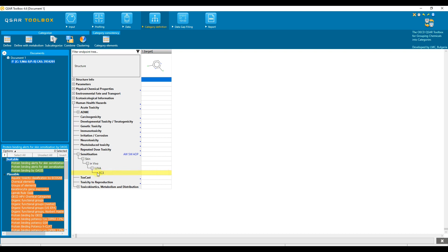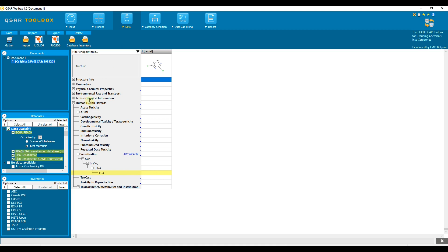In this case, the target endpoint is EC3 associated with the LLNA test for skin sensitization, which is defined in this way. The databases containing experimental data for the target endpoint must be selected, which can be reviewed in the data section.